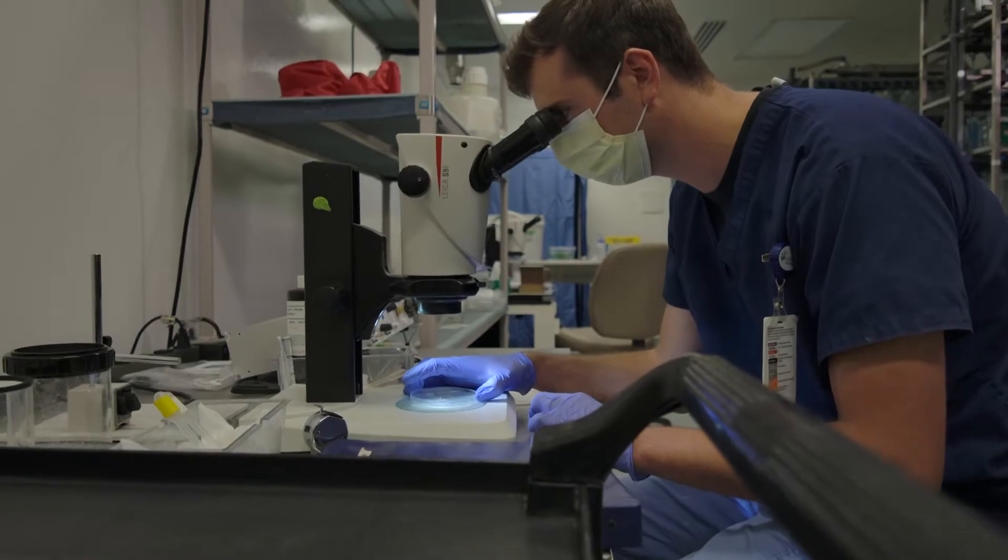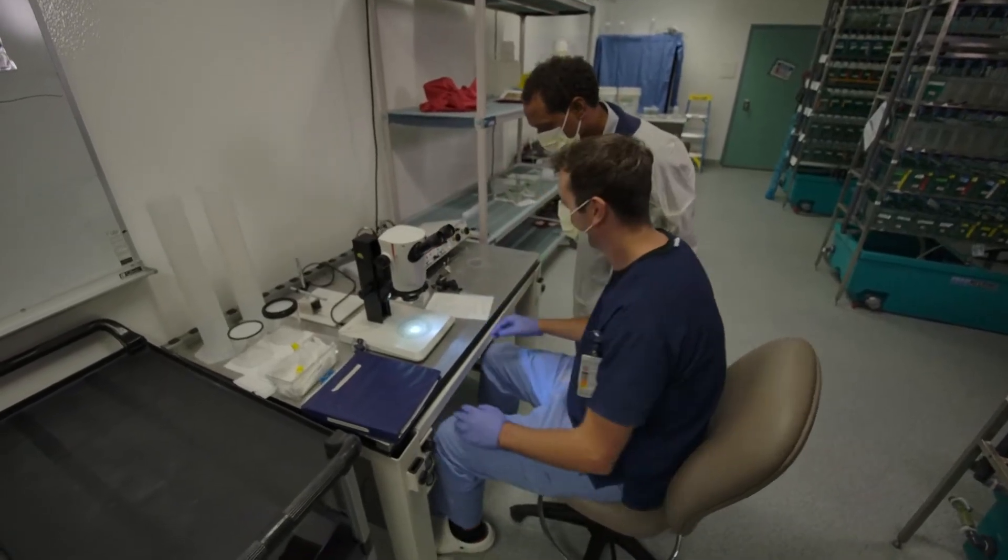We're right across the street from our hospital, from our biomedical research labs. We have two veterinarians that are certified by the World Aquatic Veterinary Medical Association.